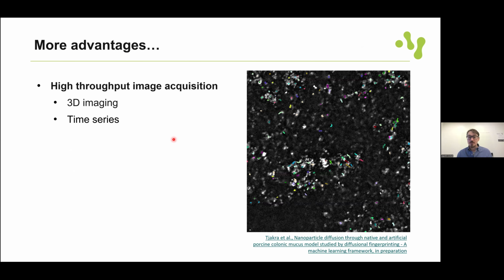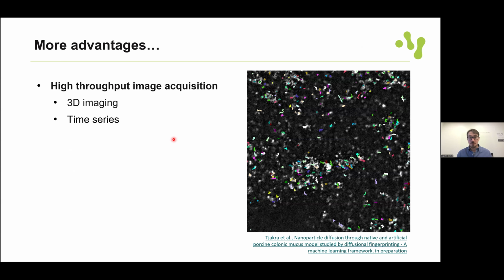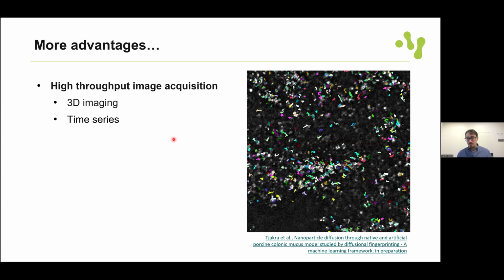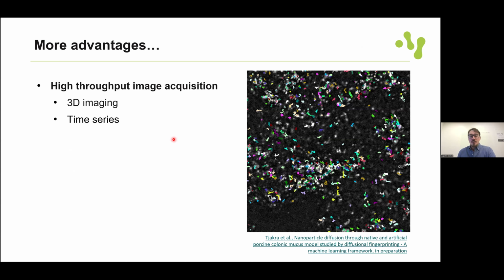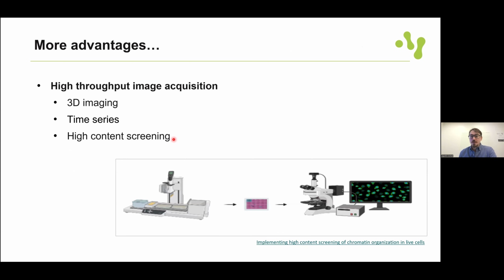We could also have time series experiments, and then we have several images. We can acquire several images per second or several images per minute, do this for many minutes, even hours or days, and this will also yield thousands of images. There are drug screening experiments, where several wells contain cells and they're treated with different drugs in each well or combinations of them.